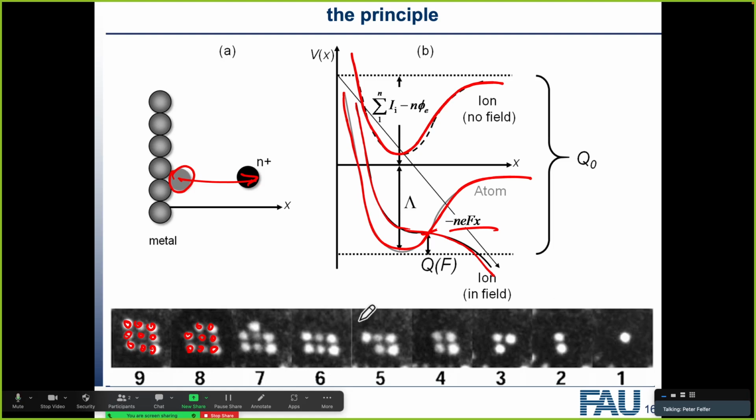If we imagine this experiment and we repeat it again, are the order in which atoms get out of the sample the same as we see here? That is a very good question. Probably no, because there's a thermal activation part. So what will happen is that the ones at the edge, you can see they're a little bit brighter, right? Because they see more field.